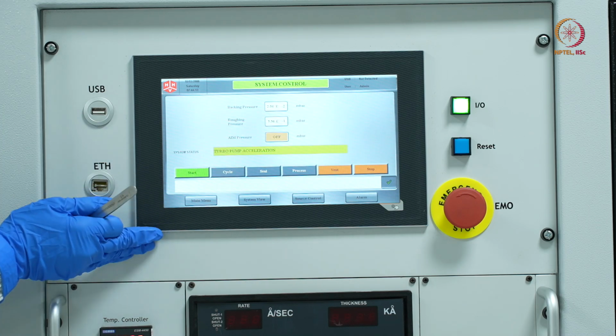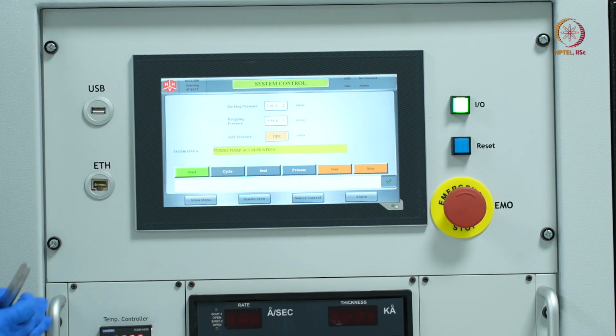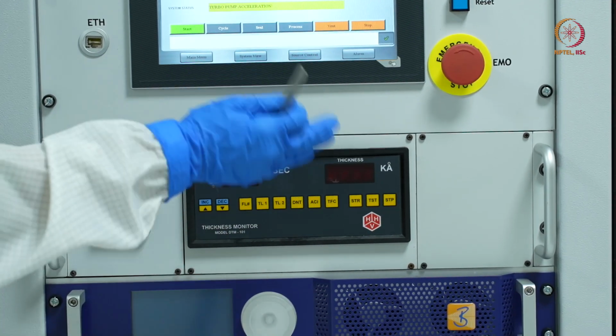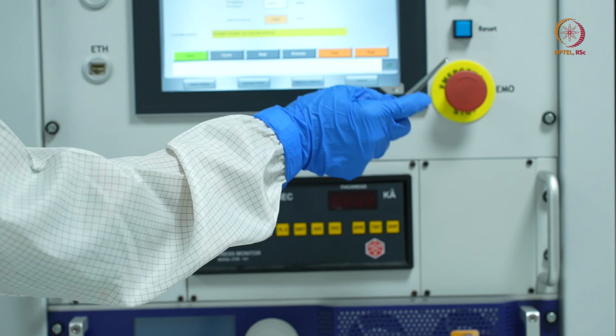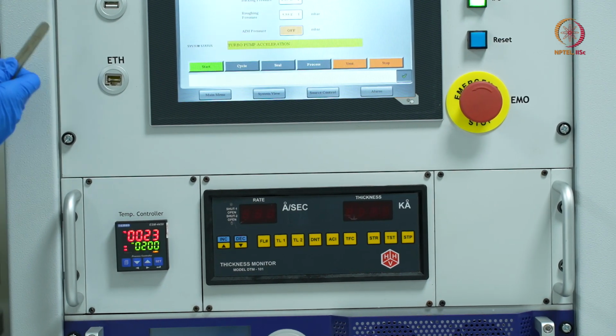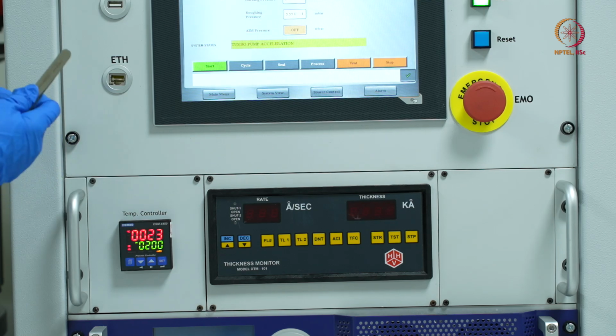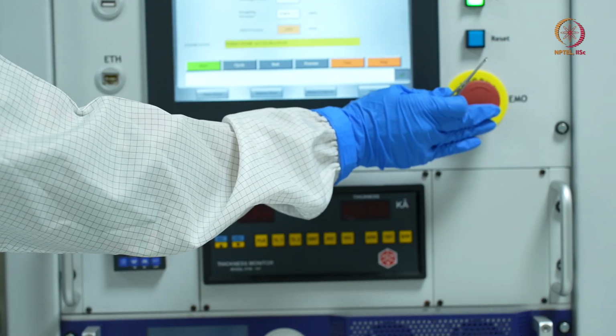This will take 5 to 10 minutes of time. Meanwhile, I'll show you other displays of the tool. This is the emergency stop button. If there is an emergency, if you can see smoke coming out from the tool, then you should press this EMO button.